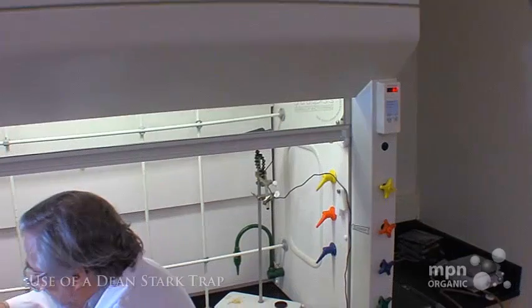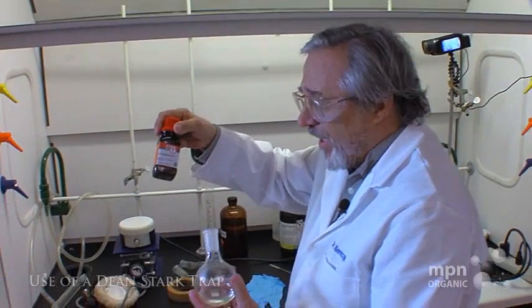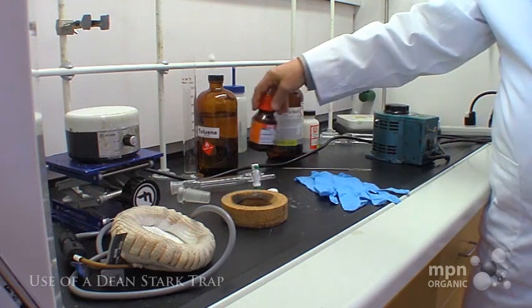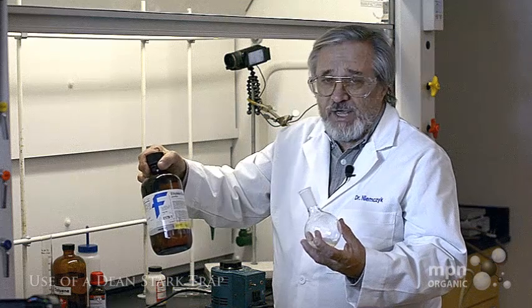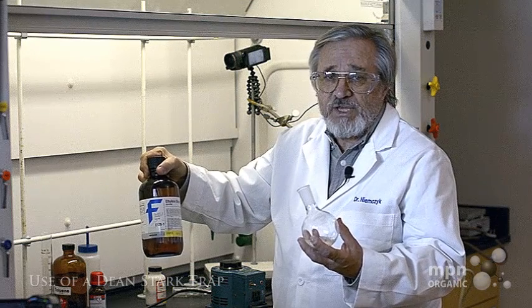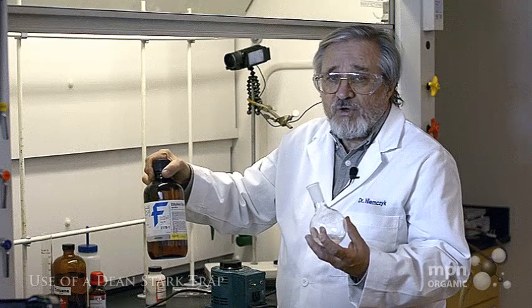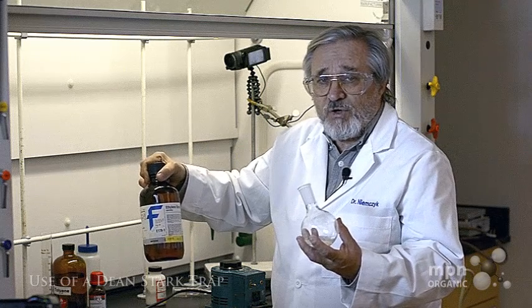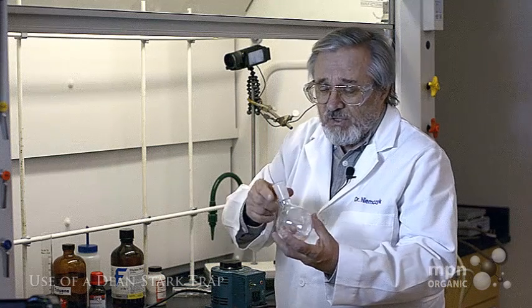What I'm going to do is take some paratolualdehyde, which is a liquid, and mix it with some ethylene glycol. Ethylene glycol is 1,2-ethanediol—it's the same stuff that you put in your radiator. You go to AutoZone, buy a quart of the stuff, and it tells you to dilute it one-to-one with water. That's ethylene glycol.